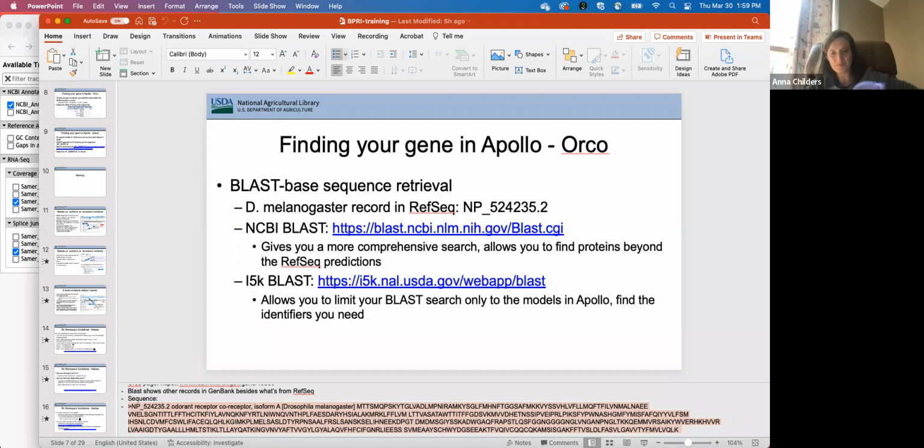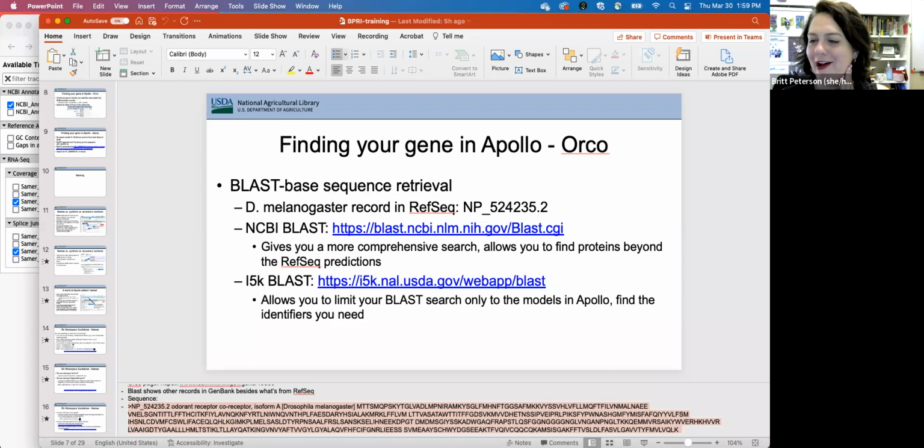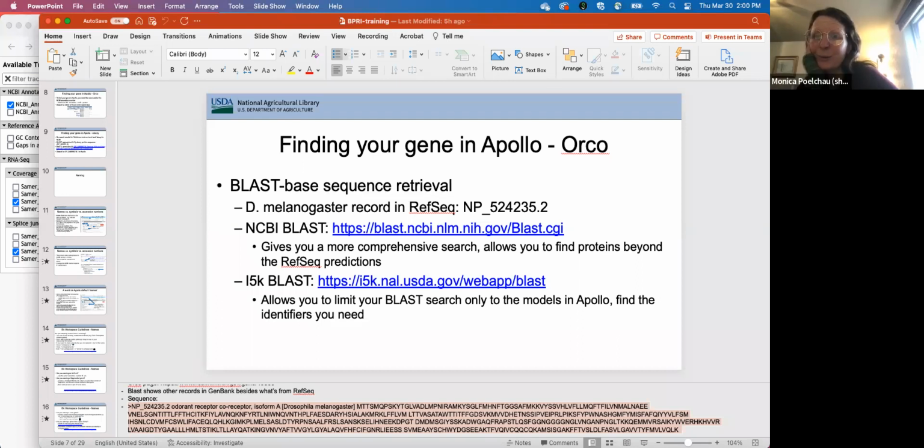Have you also done gene annotation with undergrads? Yeah, I've done it with undergrads. It's been a while, but I am refreshed to see that Apollo looks pretty similar to the last time I used it. So it hasn't changed too much. I did stuff with the bedbug genome and the Hessian fly genome. Cool. And Amanda will probably be doing at least 3 here.